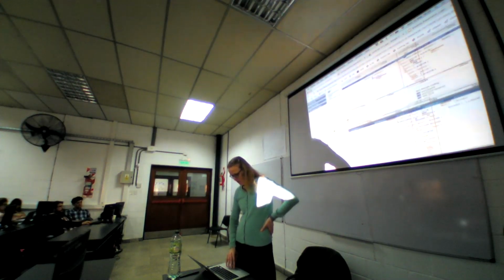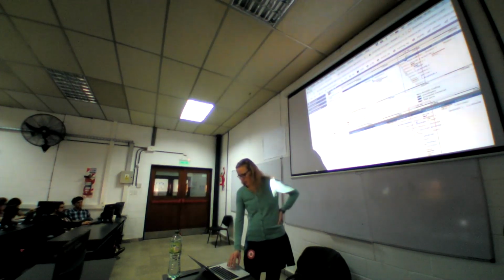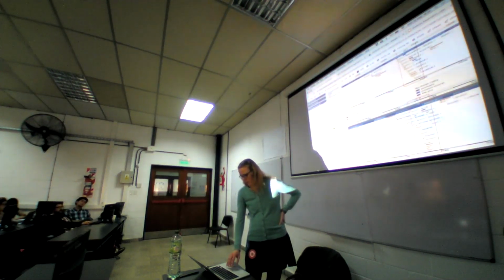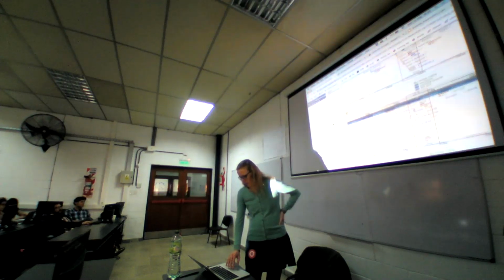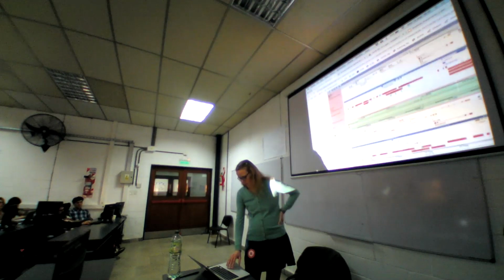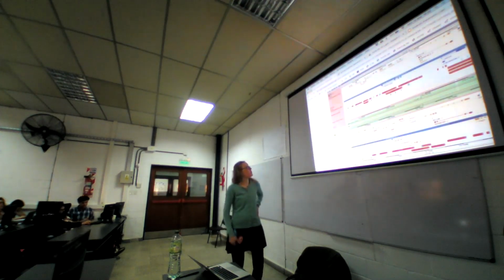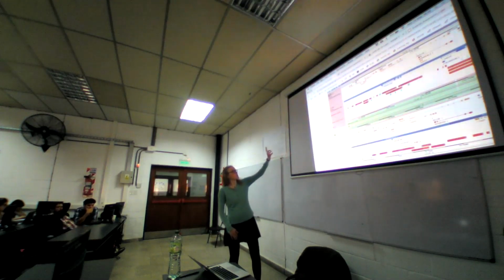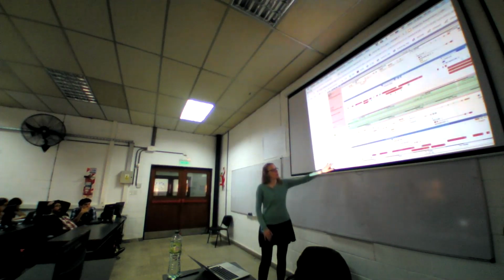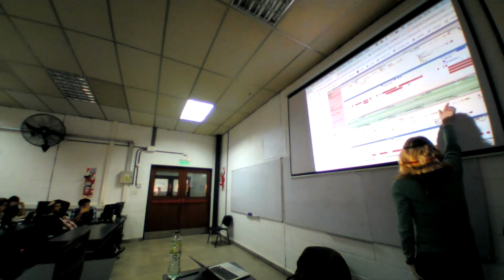And now you have your reference genomes of human and mouse shown next to each other, underneath each other, and then further down at the bottom of the page you get a more detailed view where red is human and this here is mouse, and then these pink bars represent the alignment.